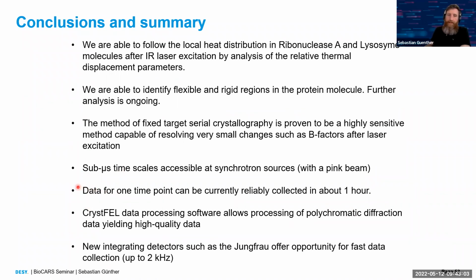The time it takes to collect one time point can of course be pushed if you use faster detectors, and also accordingly better goniometers, which can cope with these high speeds. For this, we developed the Roadrunner goniometer, which we have shown to actually work already at 1 kilohertz.